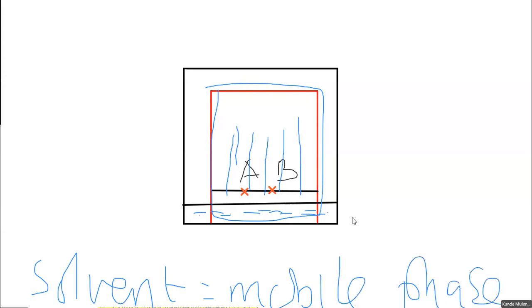Now, where is this mixture moving? This mixture is moving on the paper. This mixture is moving on this chromatogram, a paper. On the paper where you put a sample, it depends again on the type of chromatography you are performing. At times, this paper A can be aluminum foil coated with silica gel. Of course, that becomes thin layer chromatography. And then at times this paper A can be used just as a filter paper. It becomes, of course, paper chromatography.